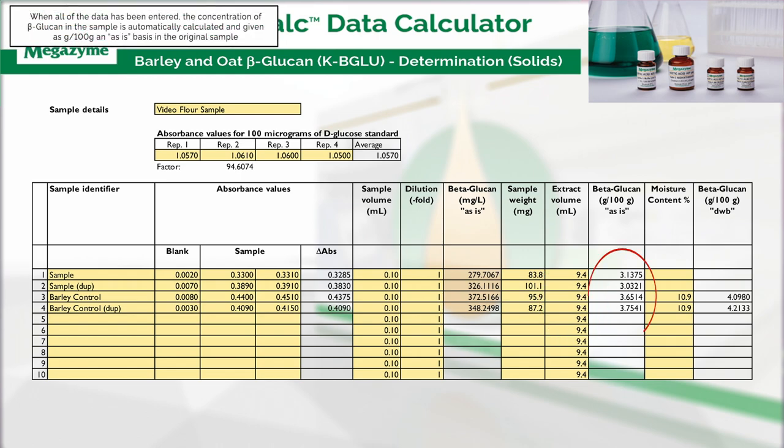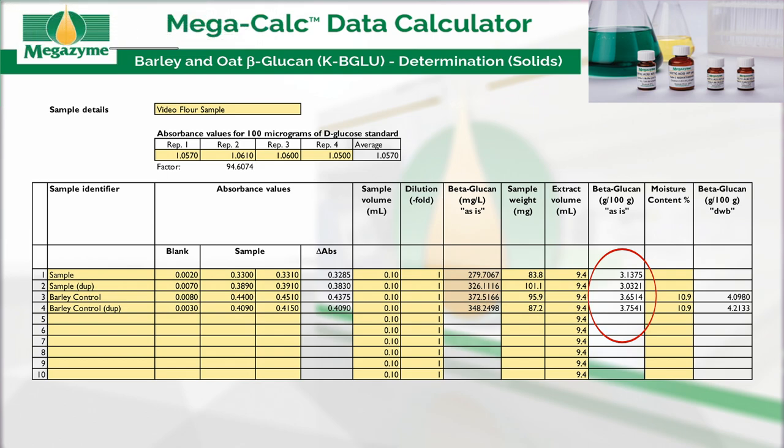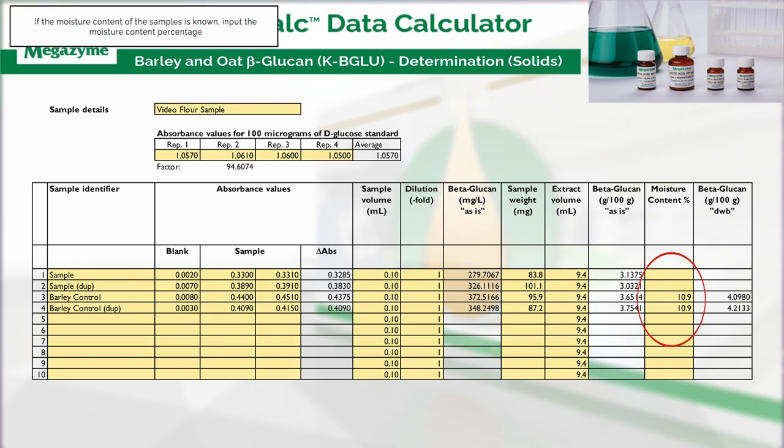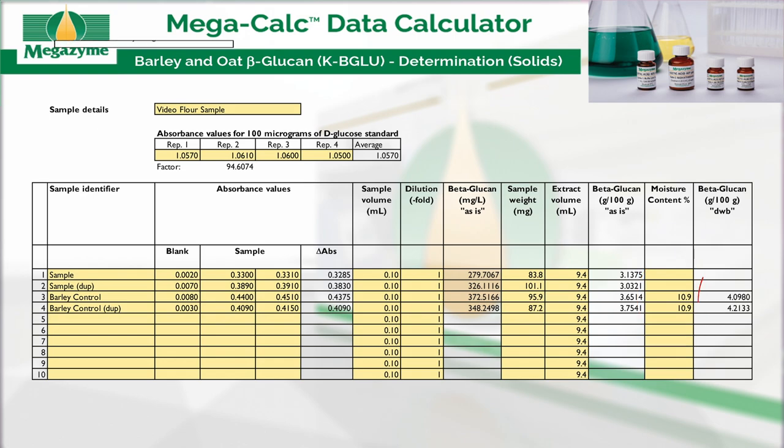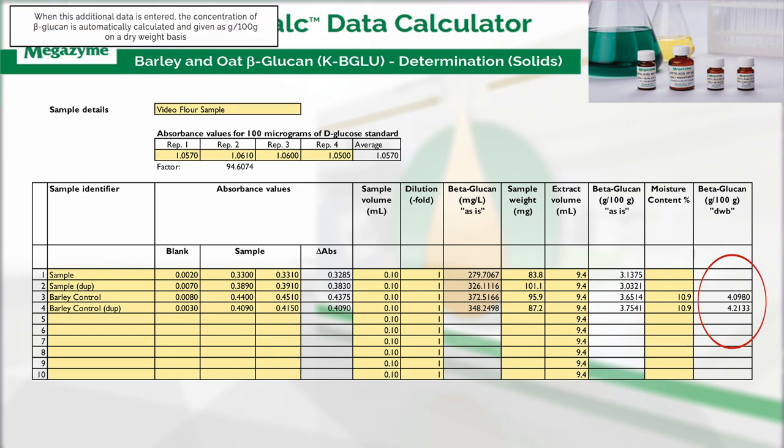When all of the data has been entered, the concentration of beta-glucan in the sample is automatically calculated and given as grams per 100 g on an as-is basis in the original sample. If the moisture content of the samples is known, input the moisture content percentage. When this additional data is entered, the concentration of beta-glucan is automatically calculated and given as grams per 100 g on a dry weight basis.